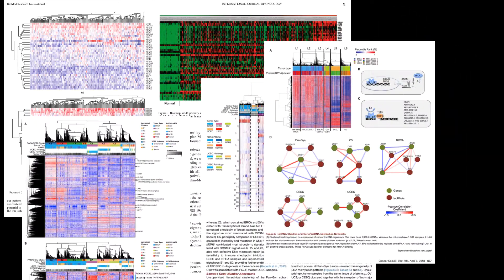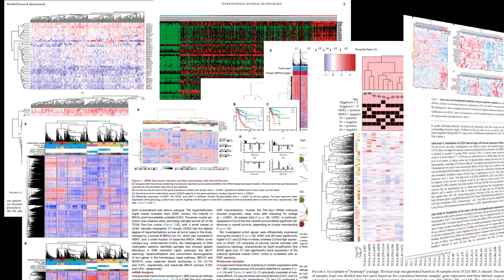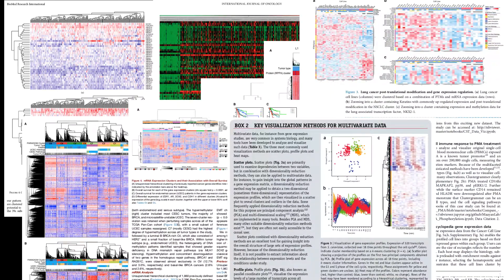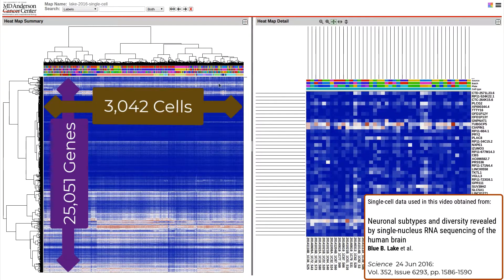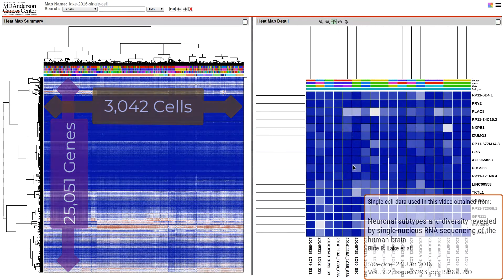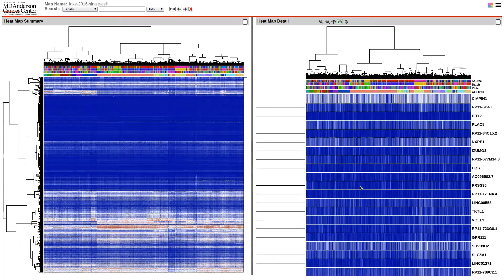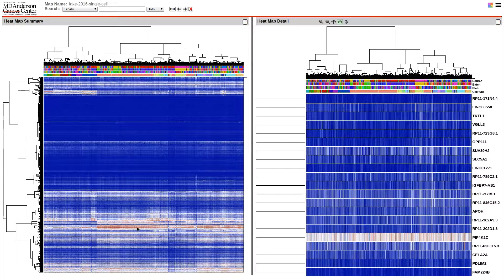However, what we really wanted was a visualization tool suited to dynamic, interactive visualization of big data. Therefore, with ITCR funding we have developed Next-Generation Clustered Heat Maps, or NGCHMs, as a best-of-breed solution for large omic datasets, with extreme zoom and fluent navigation capabilities for exploring large heat maps.